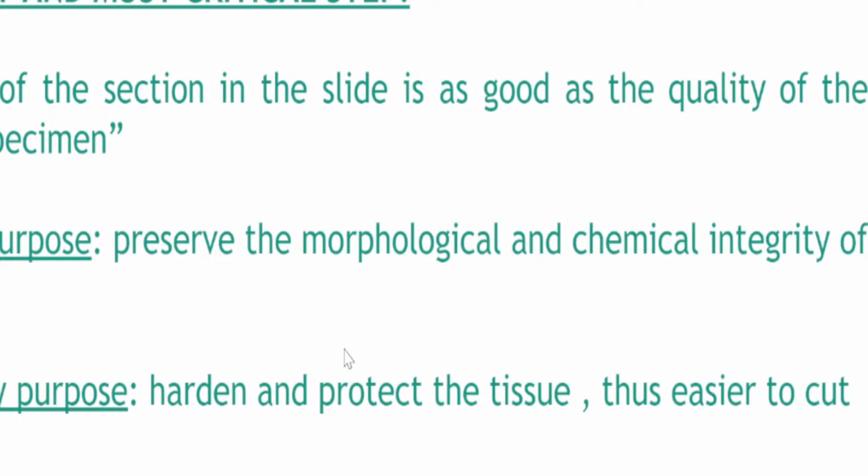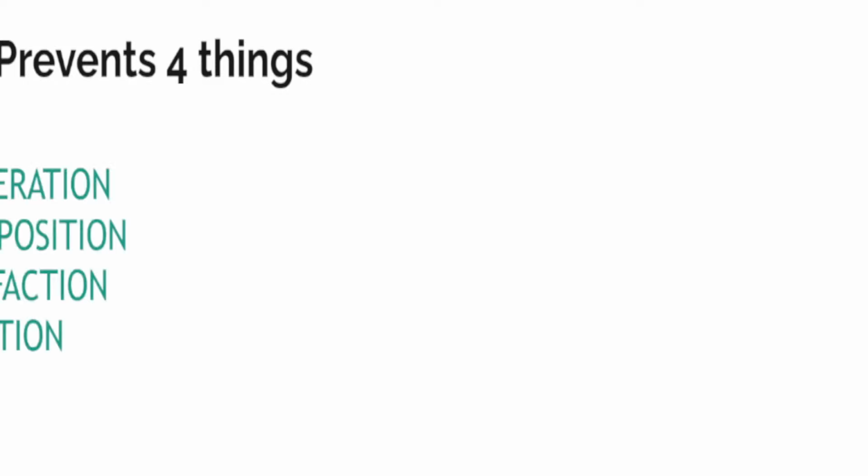Why is it highlighted, sir? Why is it underlined, sir? Because that is what you should remember as students of this lecture. Okay? Next, fixation prevents four things. It prevents degeneration, decomposition, putrefaction, and distortion.